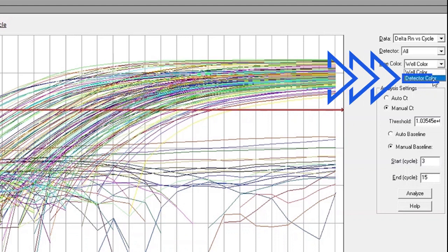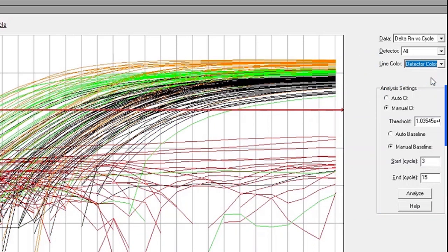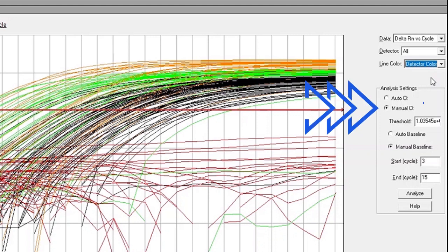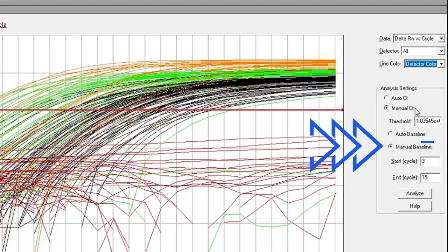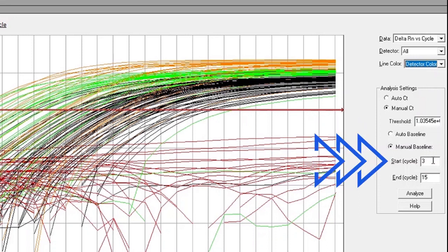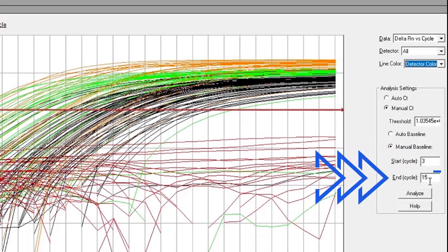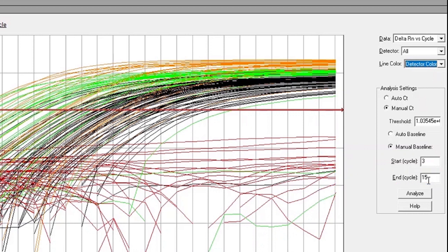Set Line Color to Detector Color. In the Analysis Settings box, Manual CT and Manual Baseline should both be selected. Under Manual Baseline, set the Start Cycle to 3 and the End Cycle to 15.